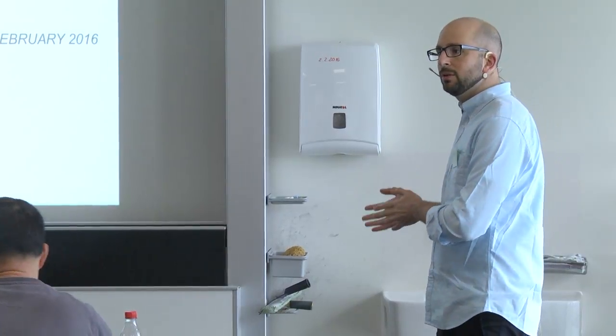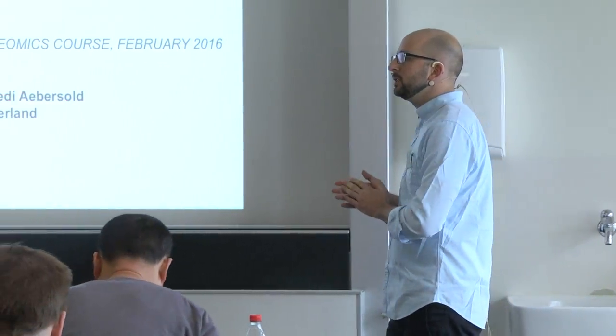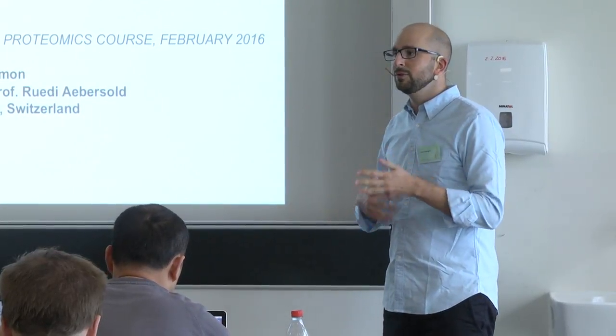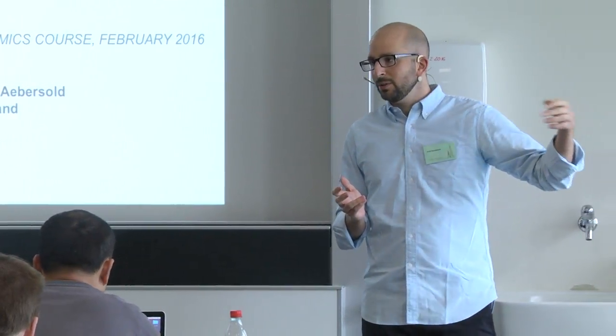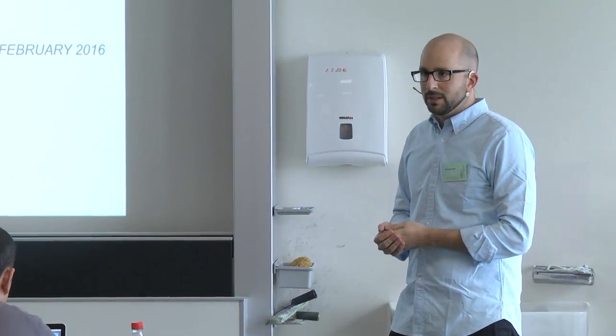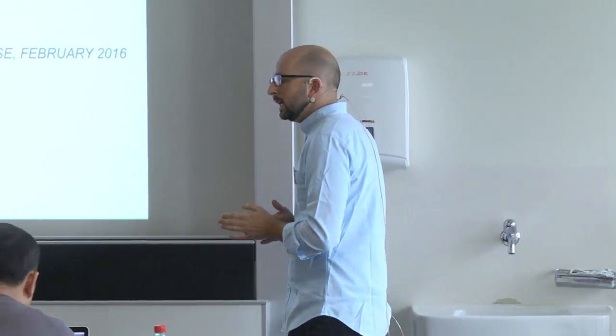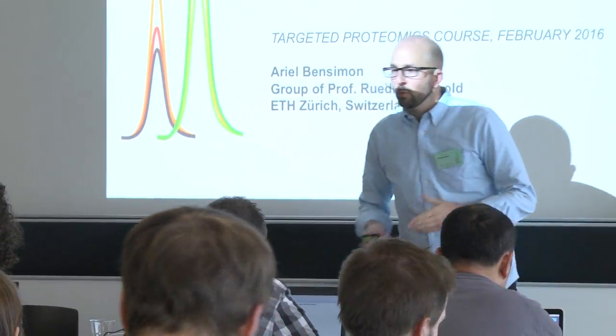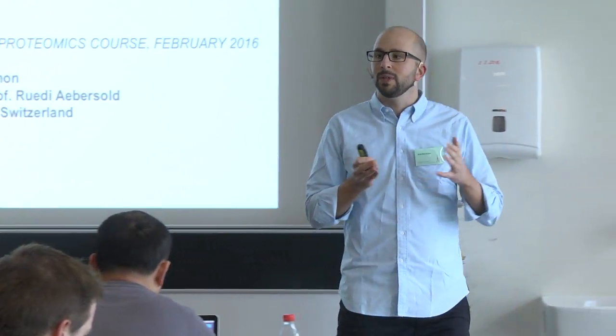The purpose of this talk is actually to go through each one of them and explain to you how we get to this. So now you've just done a tutorial where somebody already generated the library, we updated the library, and we generated a transition list. Now we'll go through all of these columns in a lecture format to understand the different considerations when we want to get to this transition list.